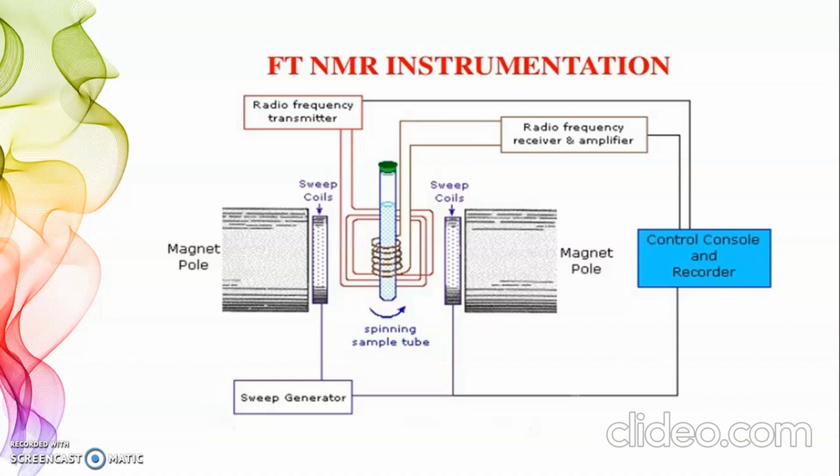Peak areas are measured by the electronic integrator that traces a series of steps with a height proportional to the peak areas. A proton count from the integration is useful to determine or confirm the molecular formula, detect hidden peaks, determine the sample purity, and do quantitative analysis. Peak positions are measured in frequency units from the reference peak.